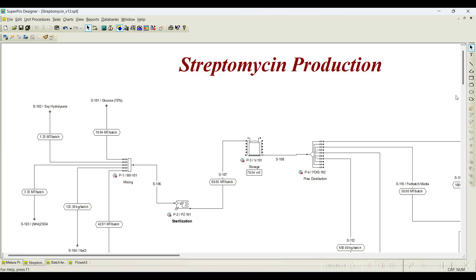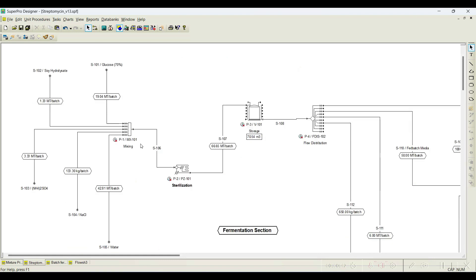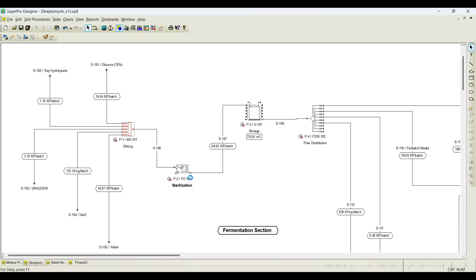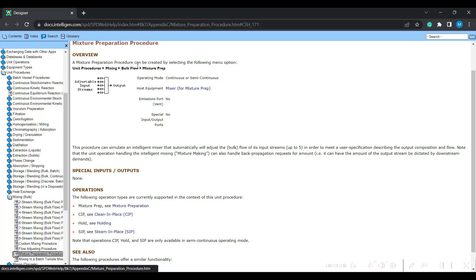When you open the streptomycin production case study shipped with SuperPro Designer, the first procedure you can notice is a mixing — basically a mixture preparation equipment. If you right-click and go to Help, you'll see that a mixture preparation procedure can be created by selecting: Unit Procedure > Mixing > Bulk Flow > Mixture Preparation.